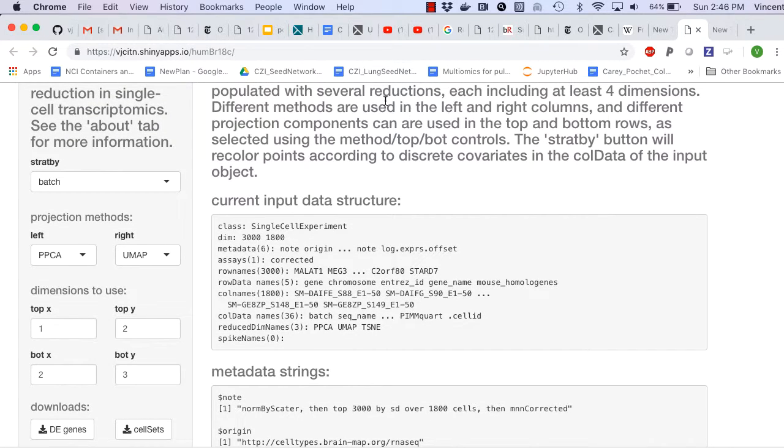We obtained a stratified random sample of 1,800 nuclei, 300 for each of two regions, the anterior cingulate cortex and the primary visual cortex, and 3 donor IDs. For each nucleus, we obtained the fraction of reads that map to introns for all genes as a cell-specific measure of prevalence of immature transcripts.